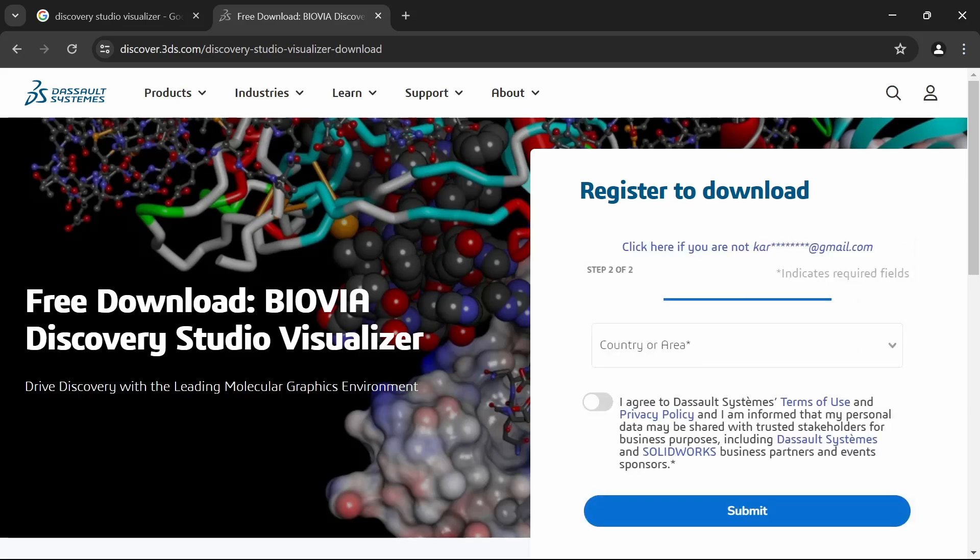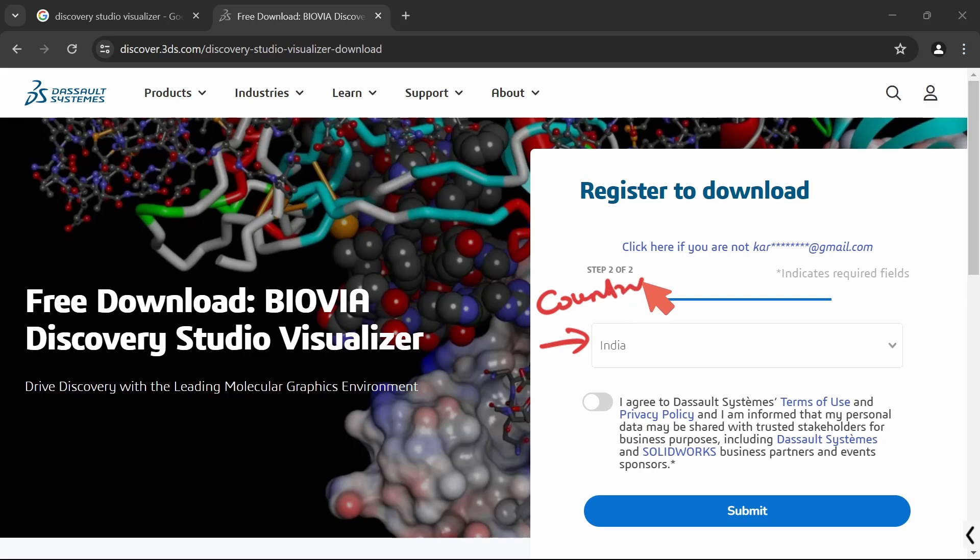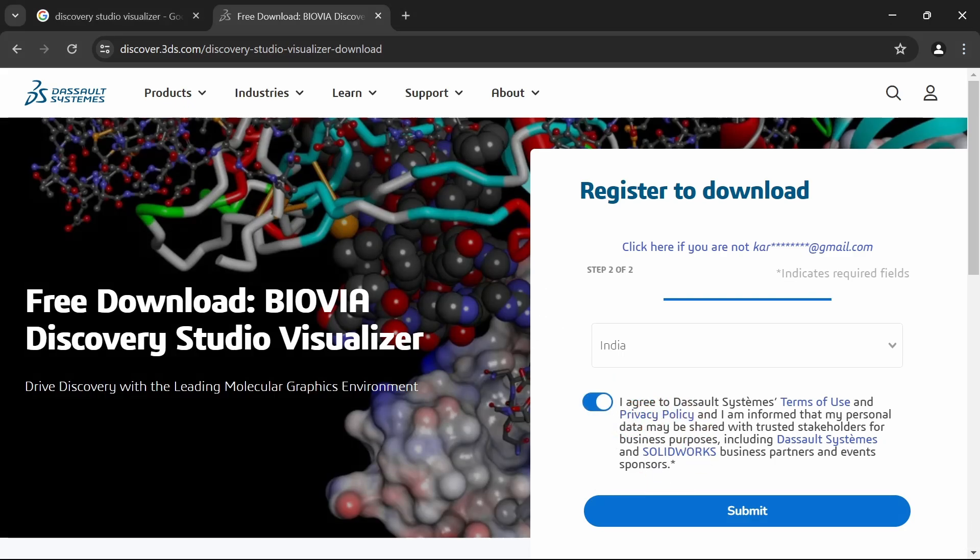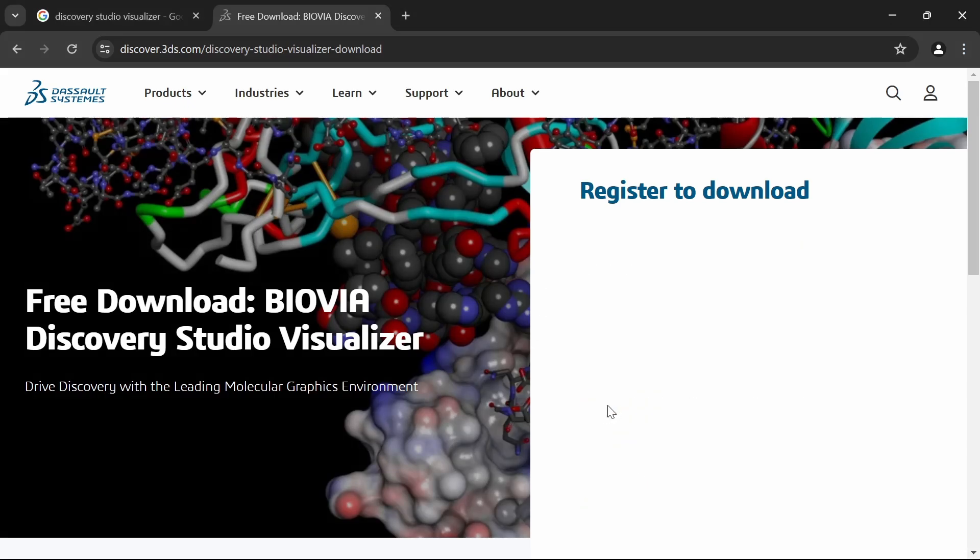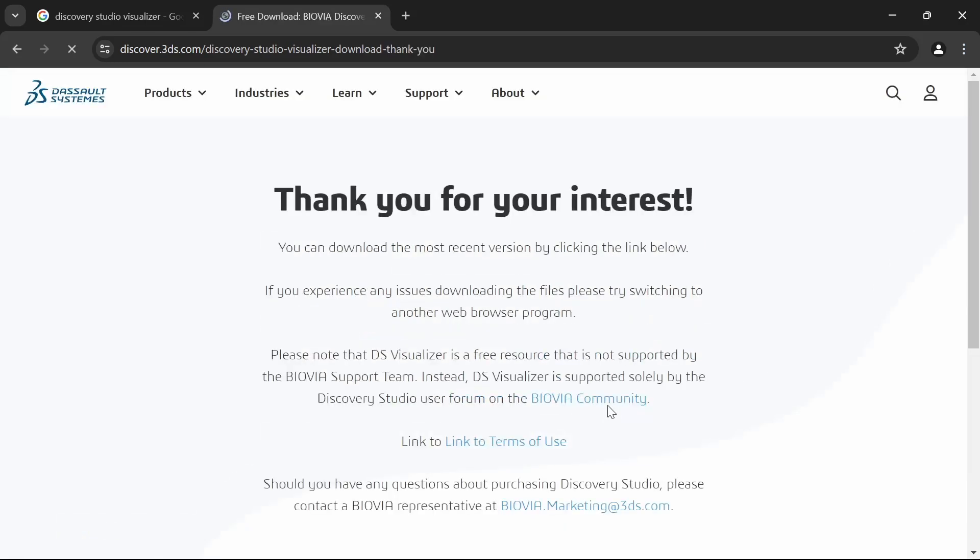After entering the email ID, click on next. And next in this page, choose your country. This is also a required field. After choosing the country, click on the license agreement. Then click on the Submit button. That's all. This is a very easy process.